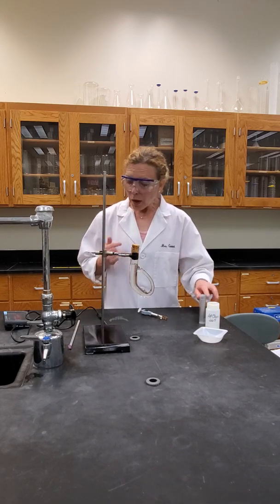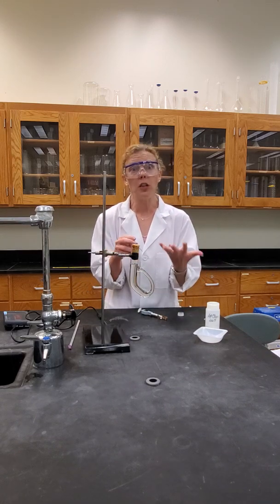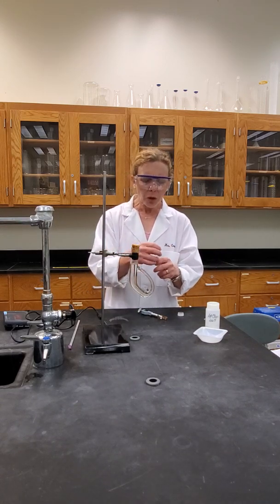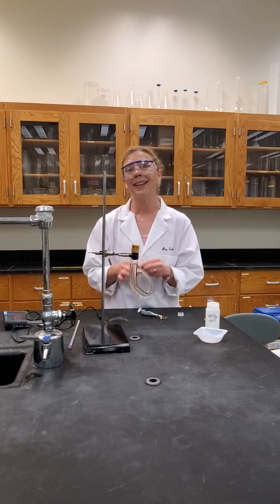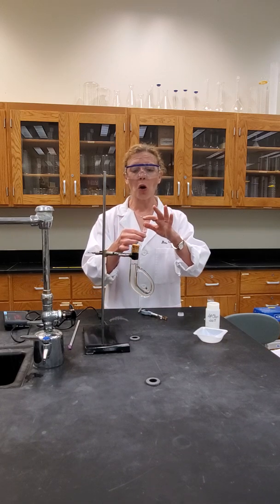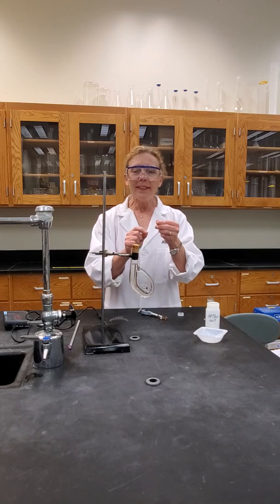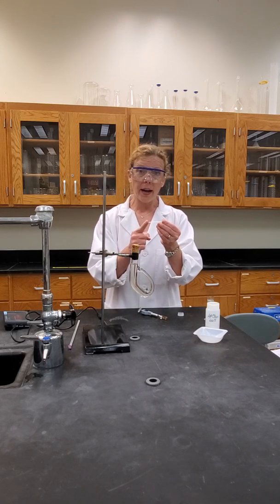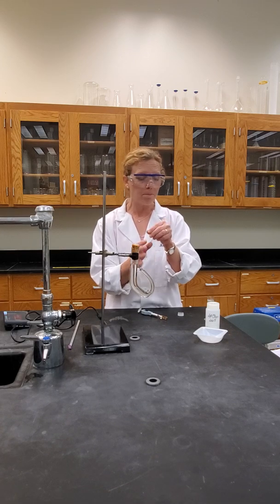So we will actually hold the sample in a capillary tube, a melting point capillary tube. Capillary tubes are just very narrow, thin-walled glass straws, if you will. Some capillary tubes are open at both ends, so it's truly like a straw. These, however, are closed at one end, so some heat has been applied to close this shut.